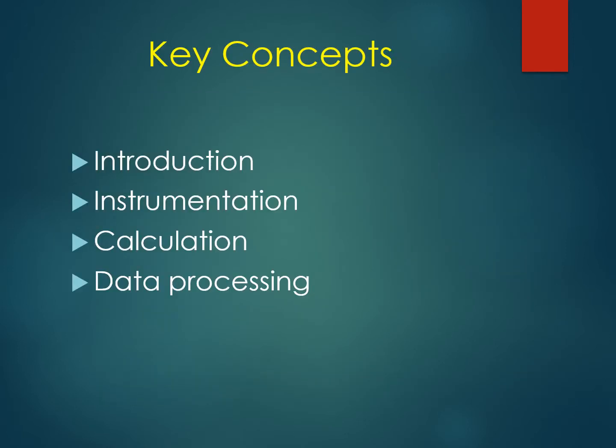The key concepts to be delivered in this lecture will be the introduction, the instrumentation of neutron activation analysis, and at the end we will discuss the calculation and the data processing involved in neutron activation analysis.